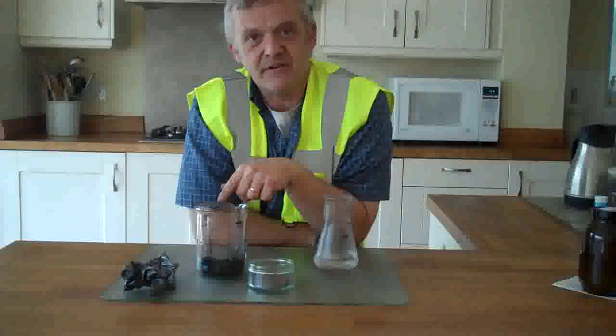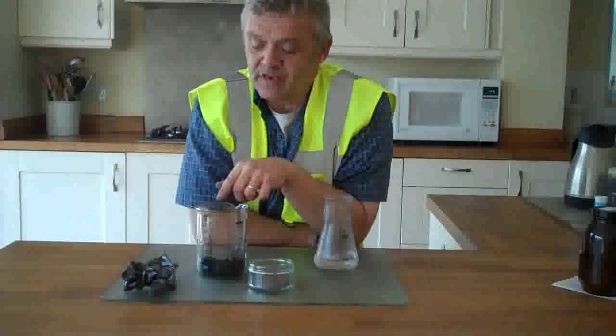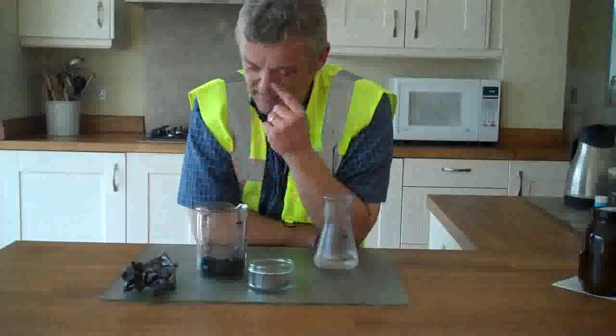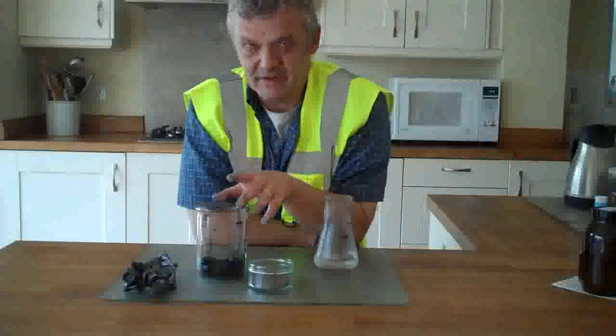We've done this in two previous videos. We made some ferric chloride in a previous video, some ferric chloride intercalated graphite, and in another previous video we exfoliated it in the microwave - and that's exactly what's in here. This is the ferric chloride intercalated graphite that has been exfoliated in the microwave, so refer to those two videos to make this stuff.